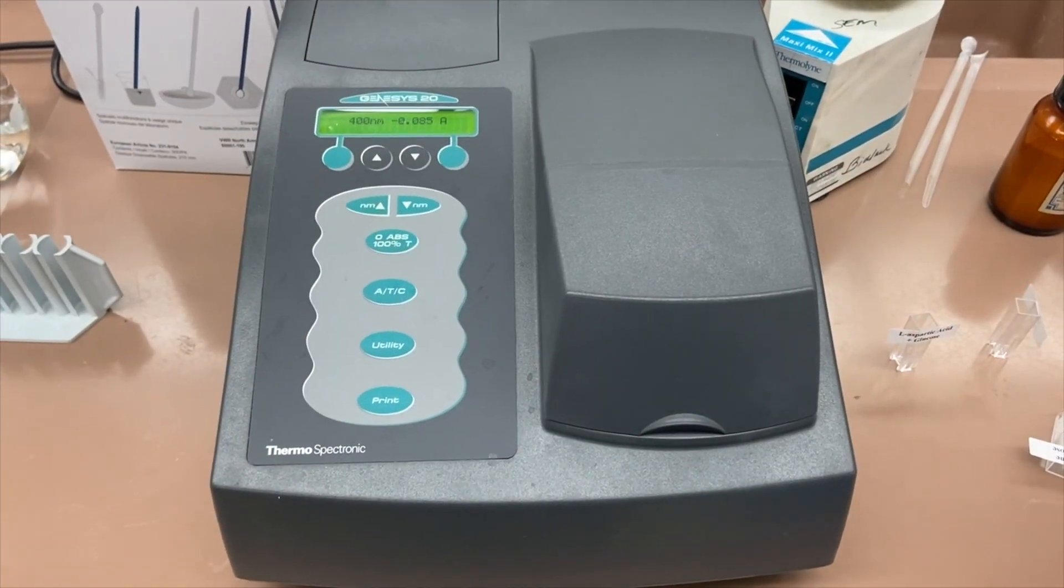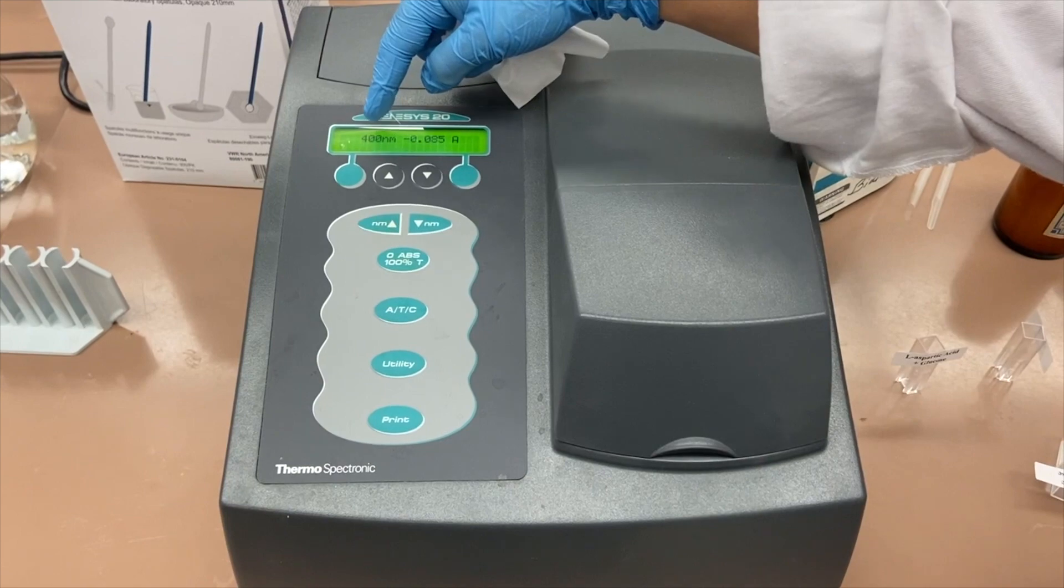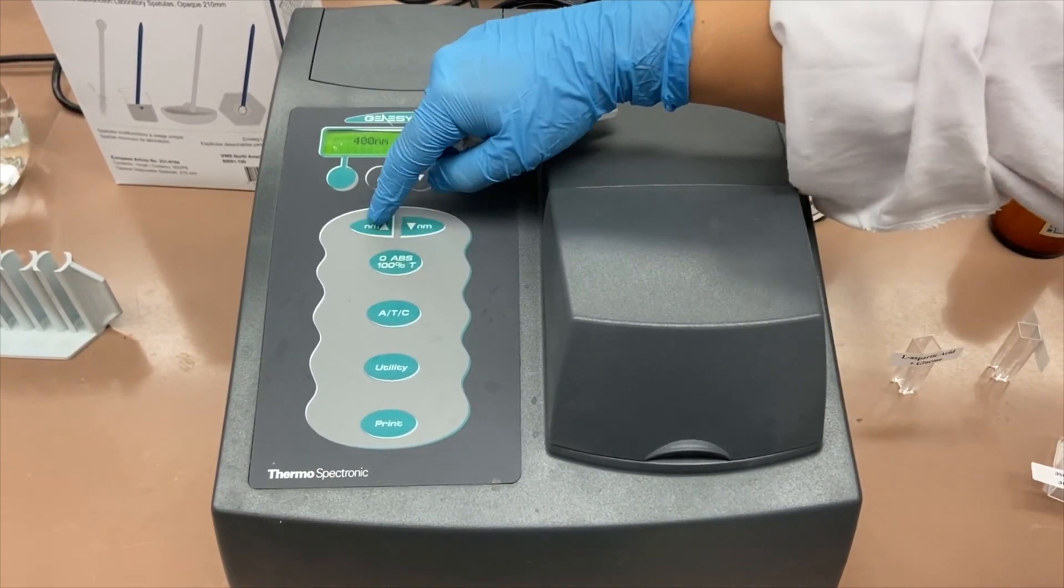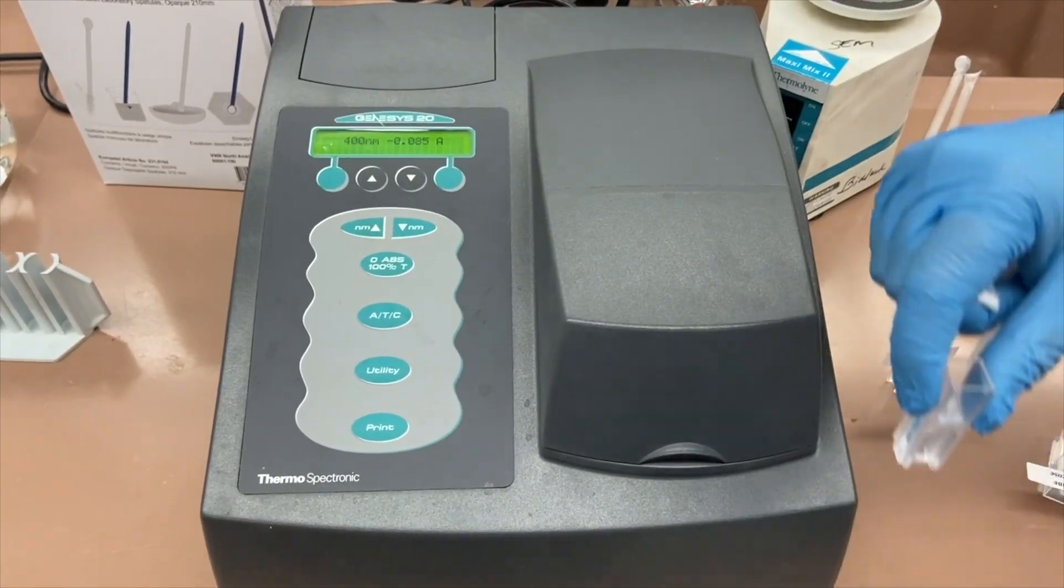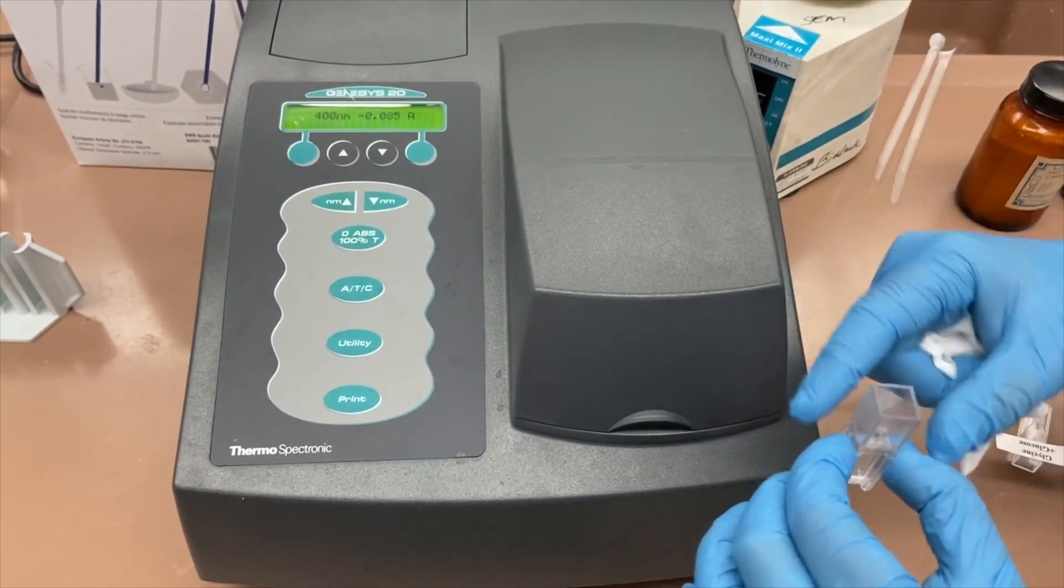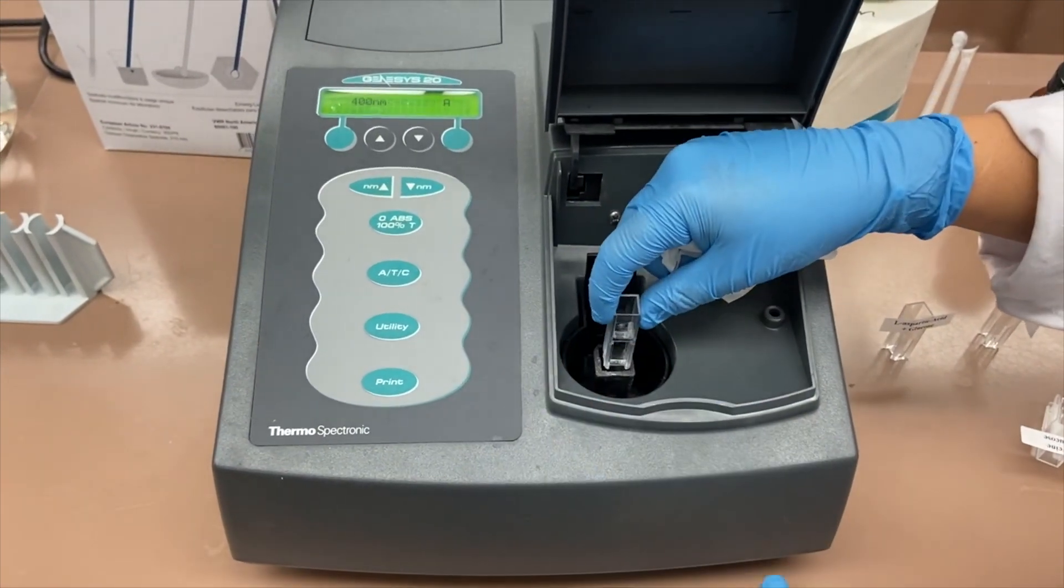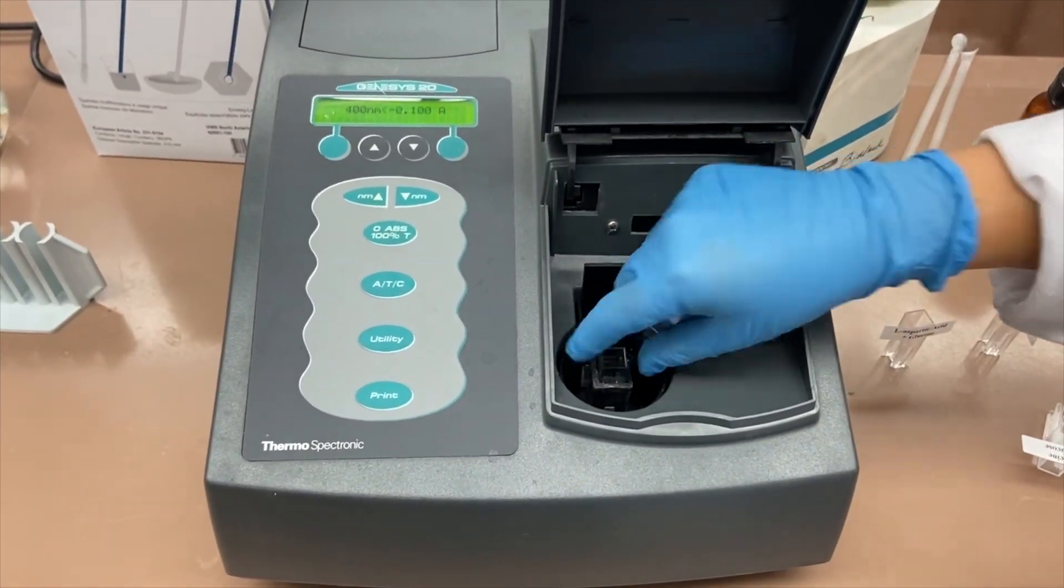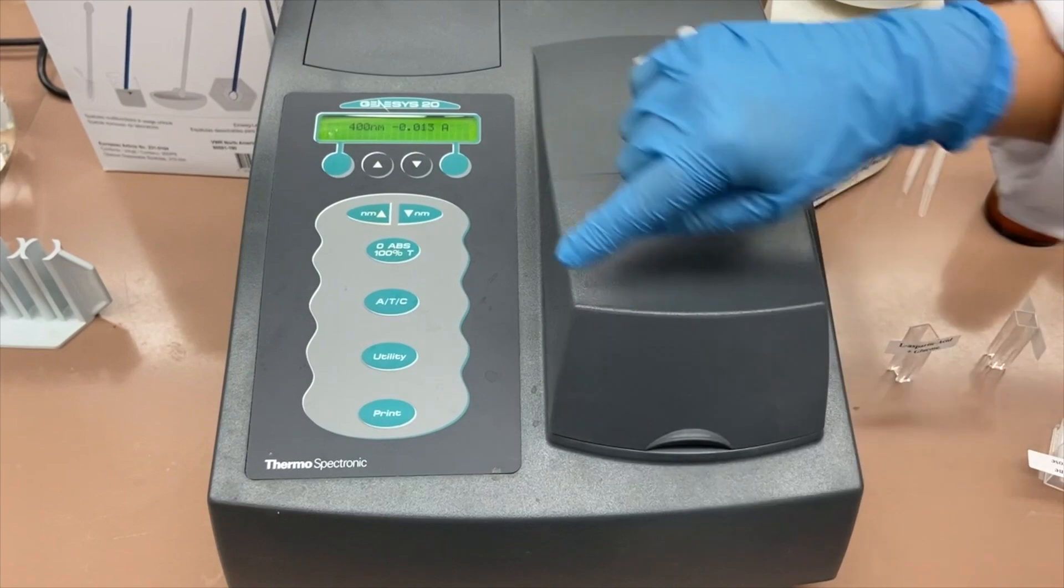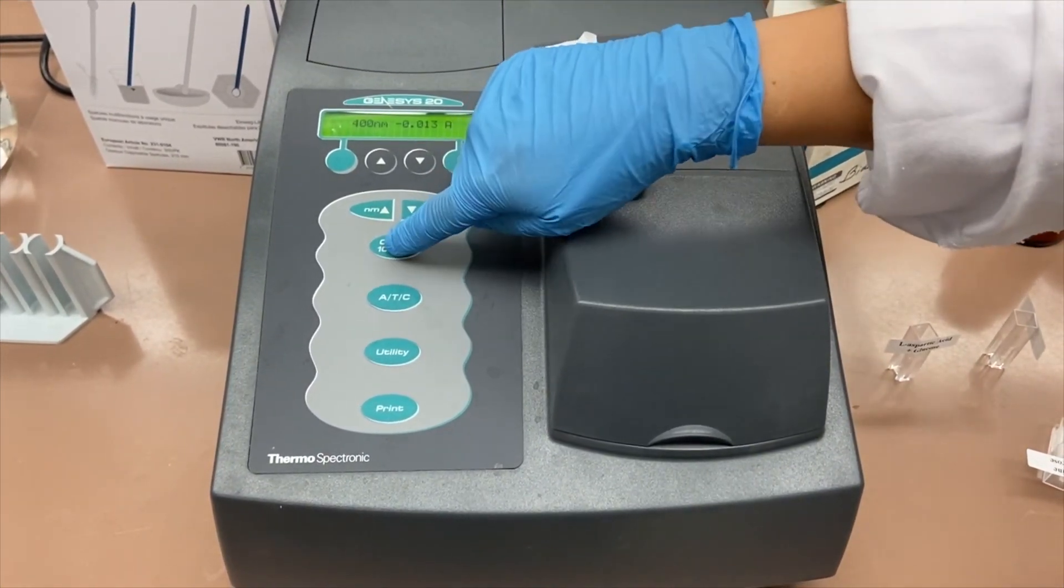This is the spectrophotometer. First, I'll set the wavelength to 400 nanometers using the up and down arrows. This is my sample—I put DI water in it. I'll place it inside, close it up, and hit this button to set the blank because the absorbance for DI water is zero.